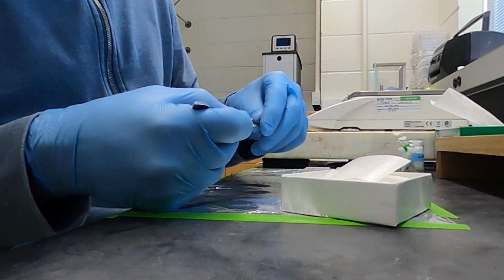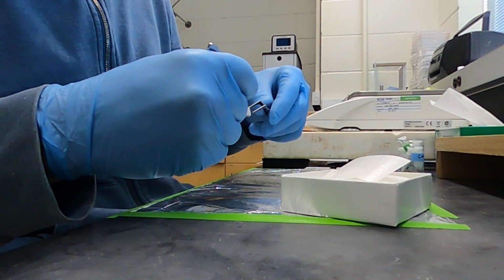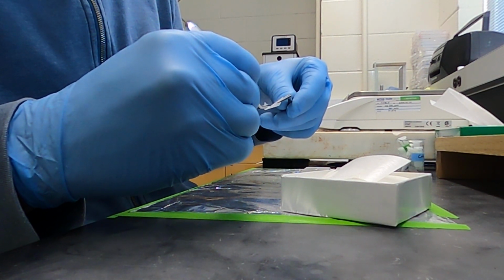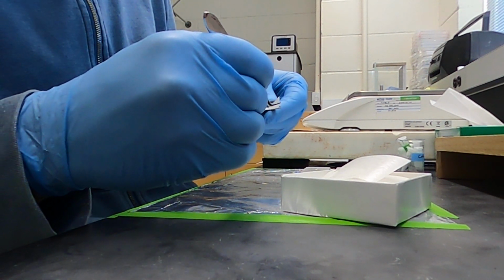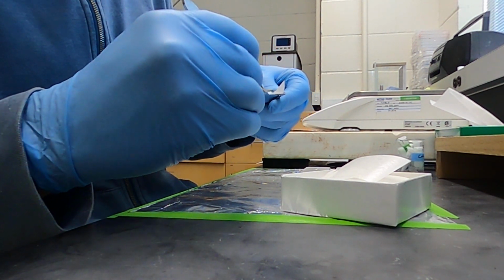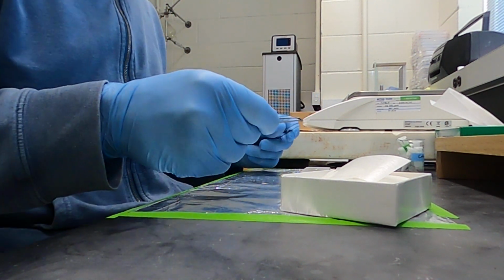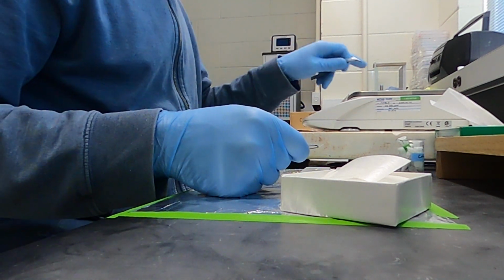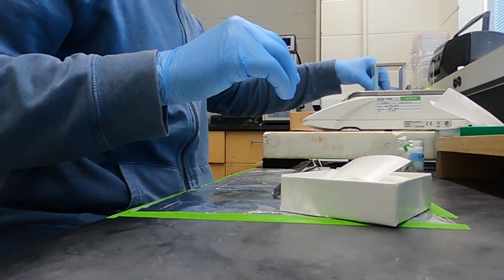I will fold it like that in the middle, and then I sort of curl it towards the inside. And the reason I'm doing this is because if you do that, it goes into the vial. It's easier to put your samples into the vial. So, putting it on a scale here that I'm going to clean first.